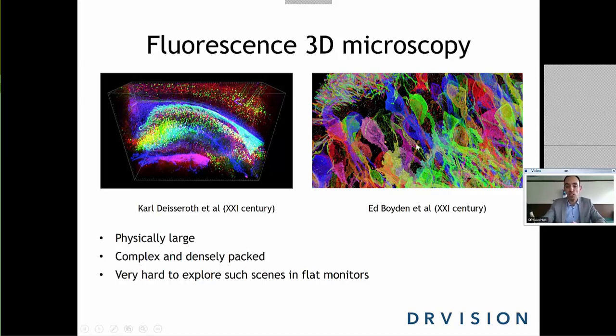So this is where the rudimentary or current methods of interacting with data sets, which rely on a flat screen, start to fall apart, because it's actually really hard to make measurements and observations on a screen that doesn't allow you to dive into it.